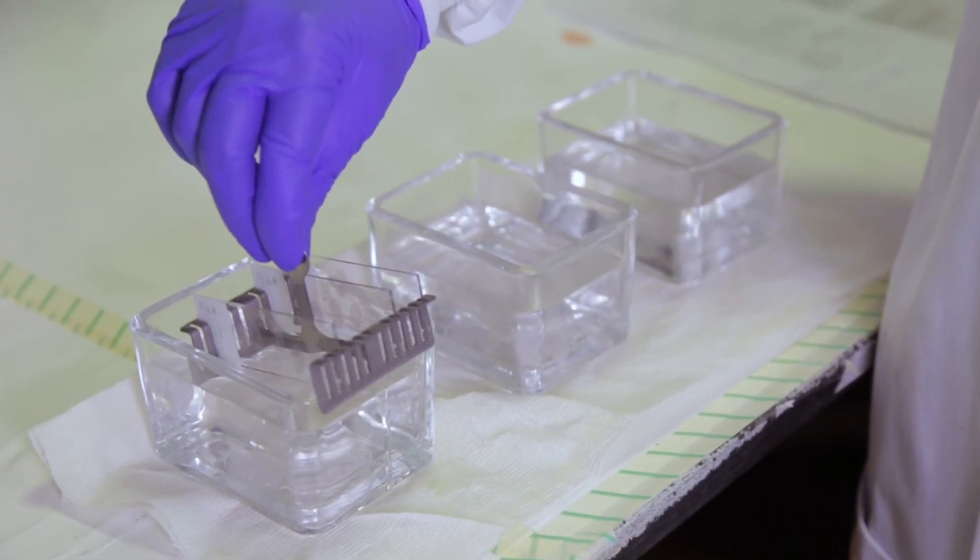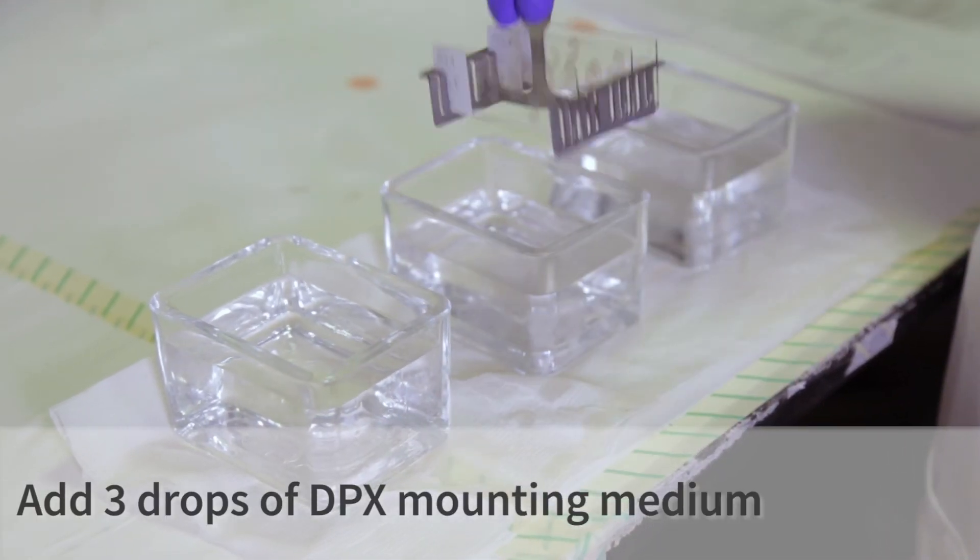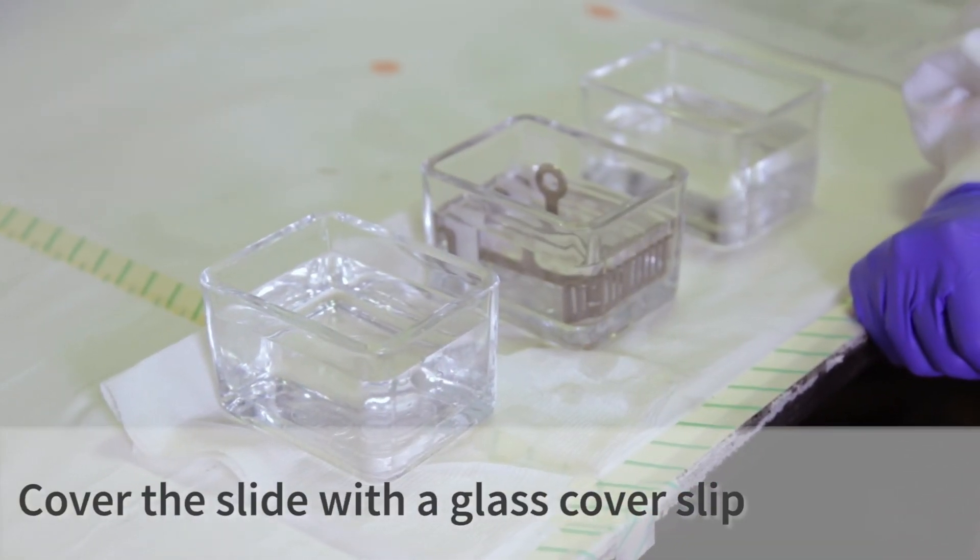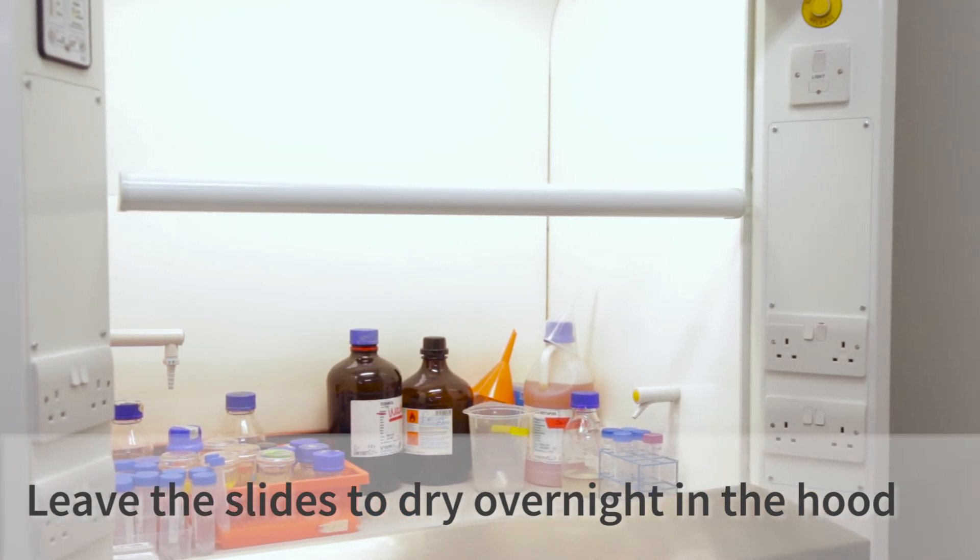After the histoclear washes, the slides are mounted by putting three drops of DPX onto the slide and then covering with a cover slip. Use DPX in the fume hood.